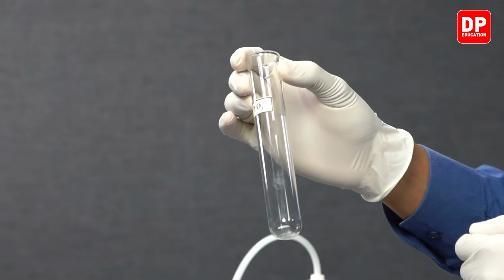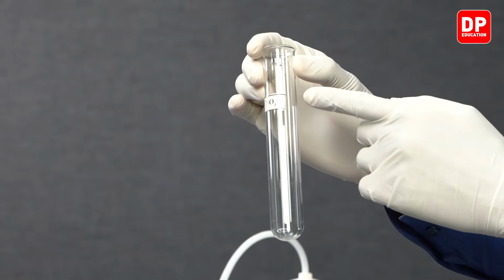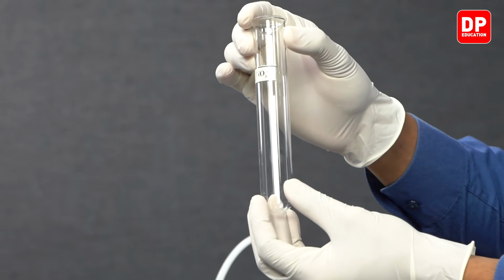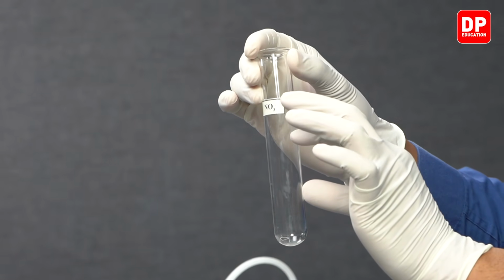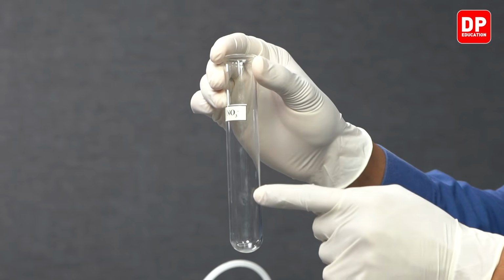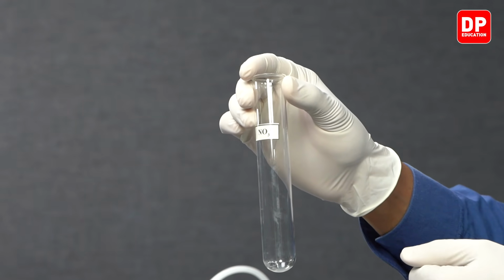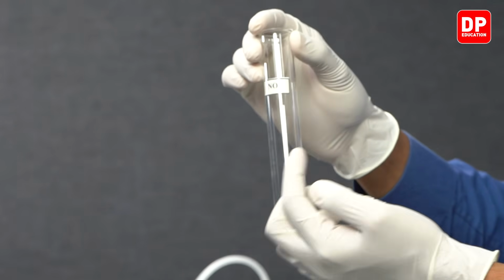So as we add sulfuric acid along the walls of this boiling tube, since concentrated sulfuric acid is high in density, sulfuric acid will sink to the bottom of the boiling tube while keeping our Fe2+ and nitrate ion solution on the top layer. And where the two layers meet, there will be a reaction taking place, and you will see a brown color ring forming.